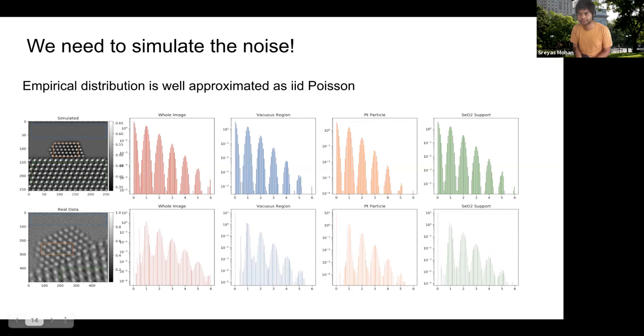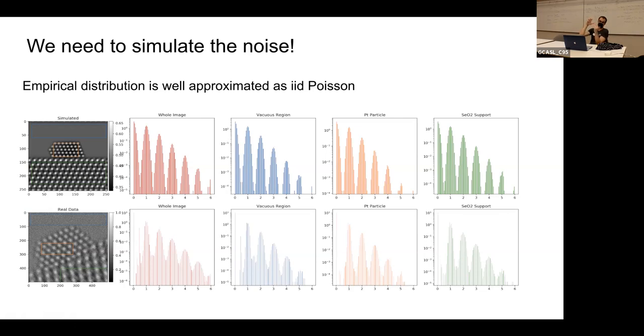That's what happens. How many sensors are there? They have an array of sensors. It's like in your camera. In your camera, you have an array where the photons hit. In this case, it's an array where electrons hit. Each spatial location that you capture is a sensor. The brighter a dot looks, the higher the count it gets. So for every pixel, there's a detector. That's what we call a pixel. The pixel that we define is only as fine as the detector array that we have.